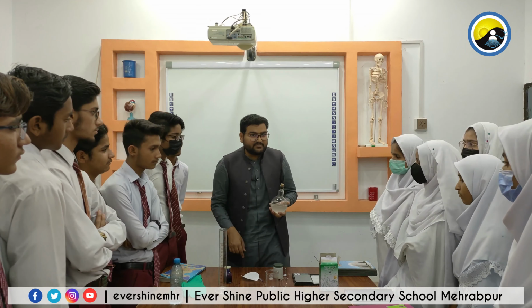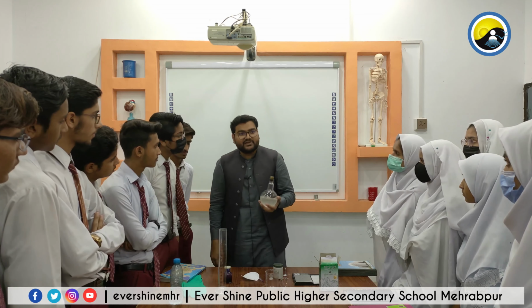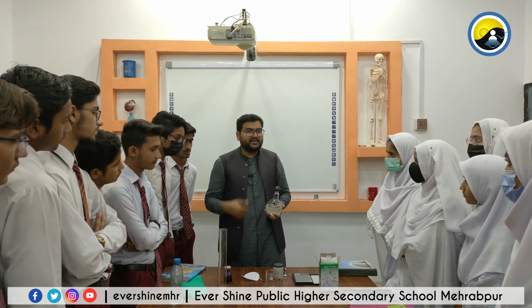Is there any other question? Yes, sir. Why do we use this glucose, sir? Because glucose is a reducing agent and we always need a reducing as well as an oxidizing agent for a redox reaction. Is there any other question?